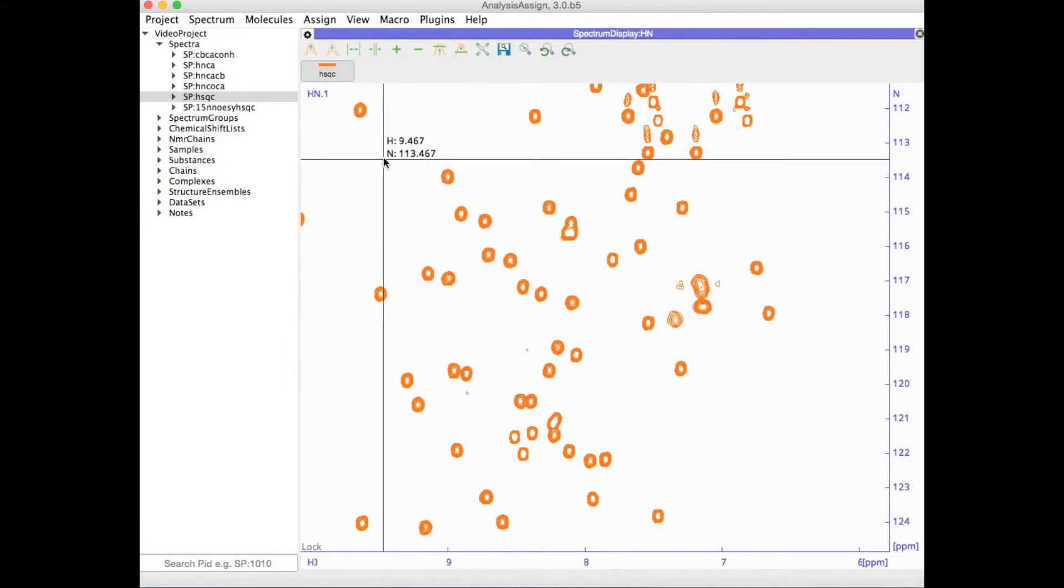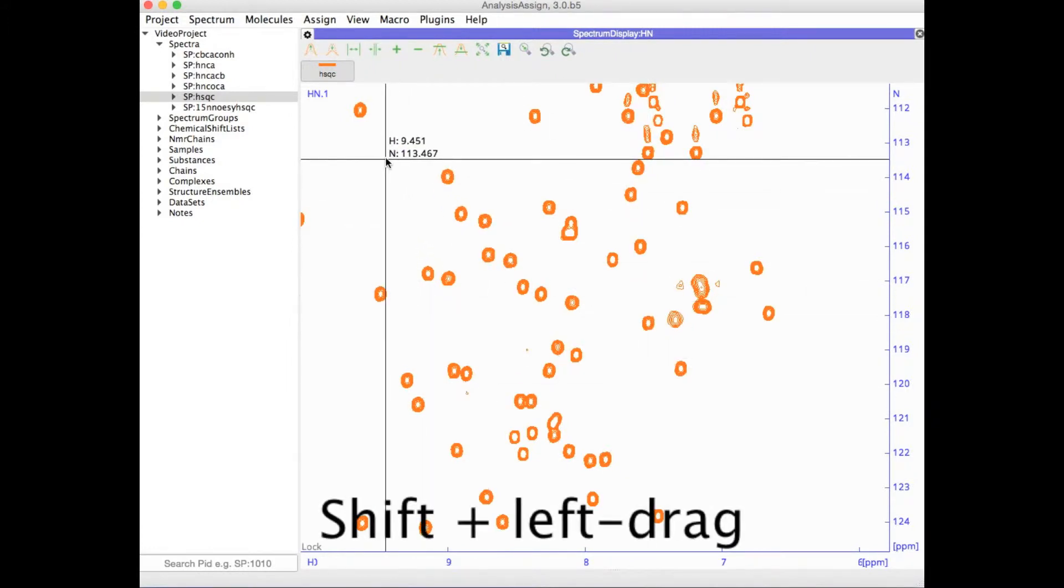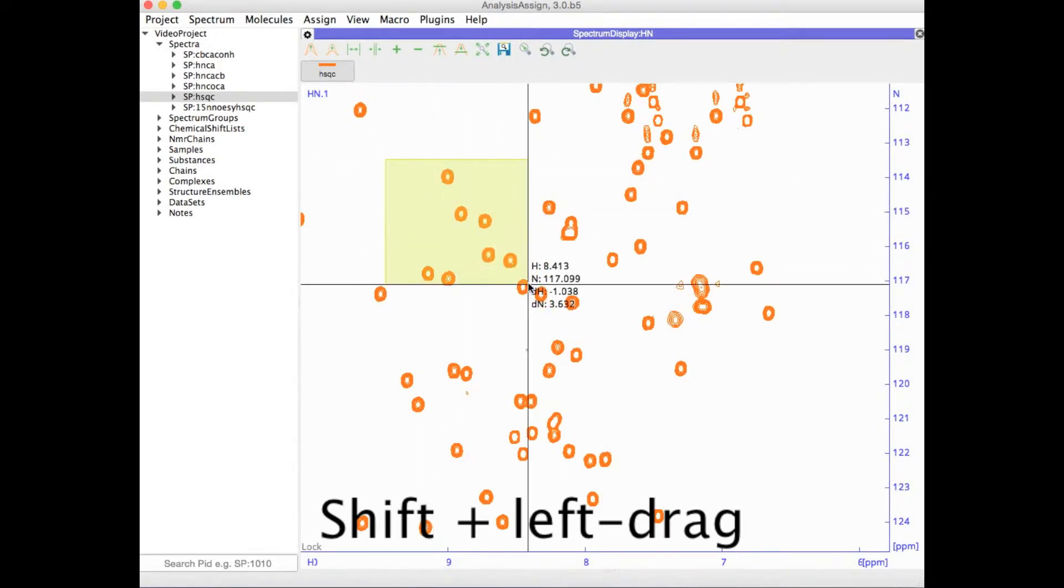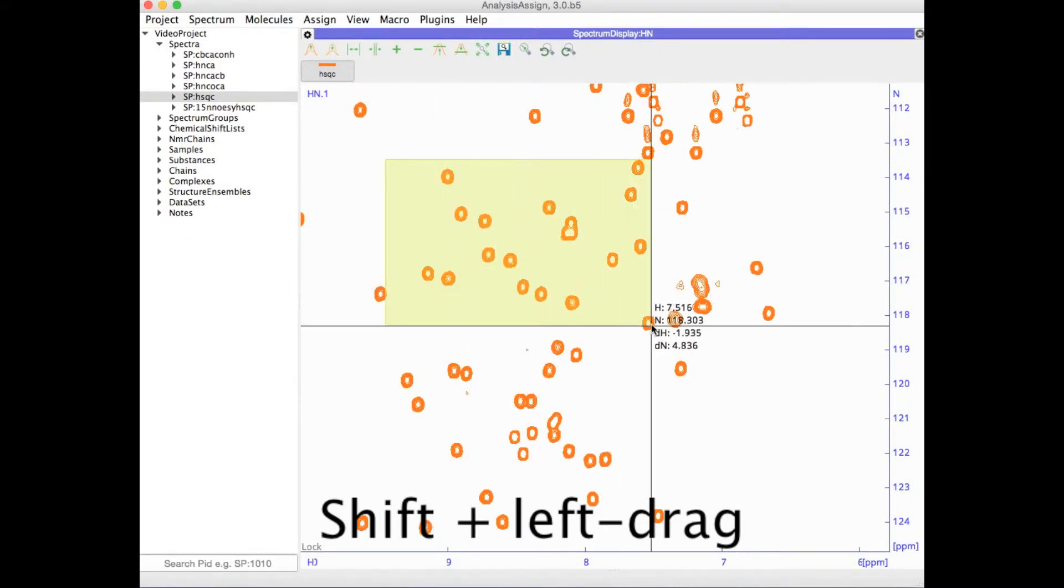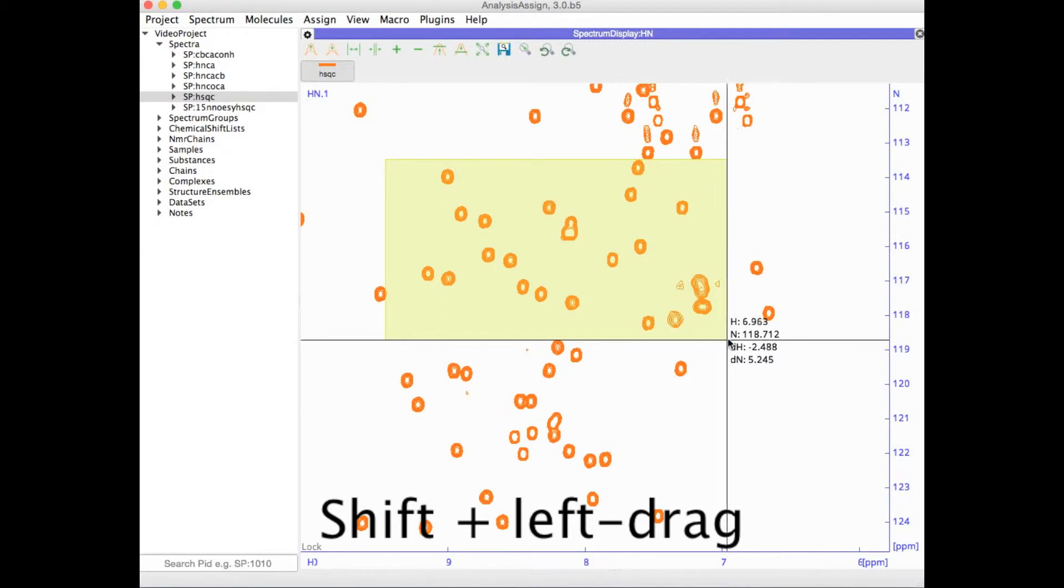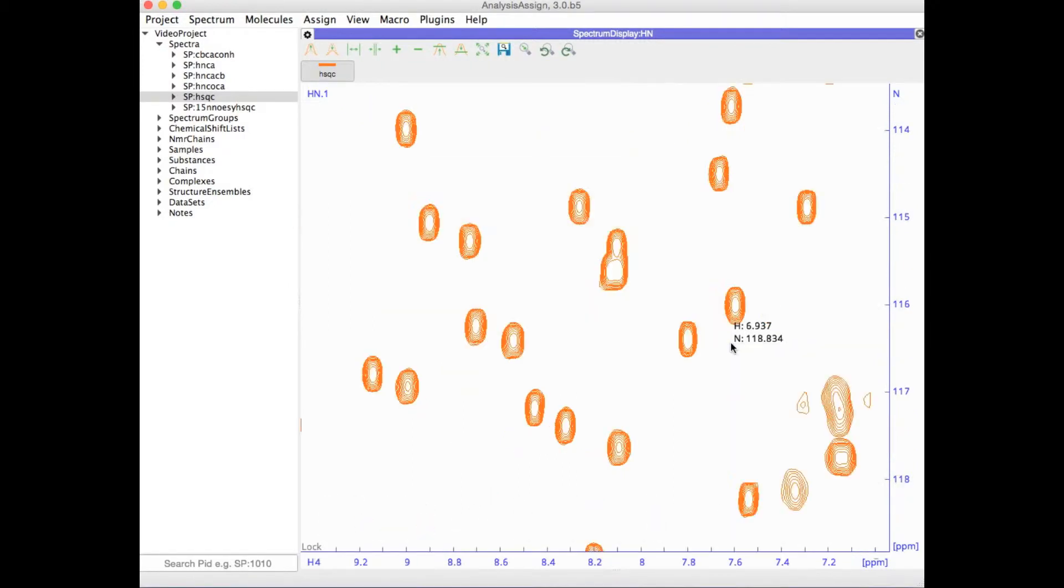You can also do an area zoom if you hold down the shift key and then drag the mouse over a particular area. This will draw a yellow box and you will zoom in.